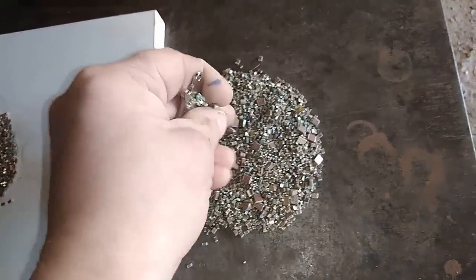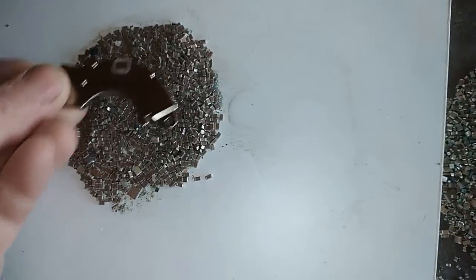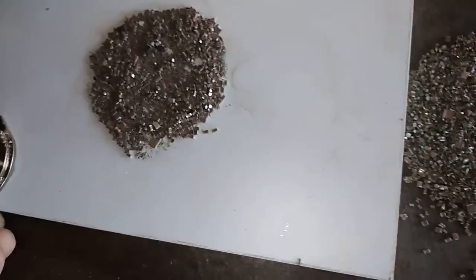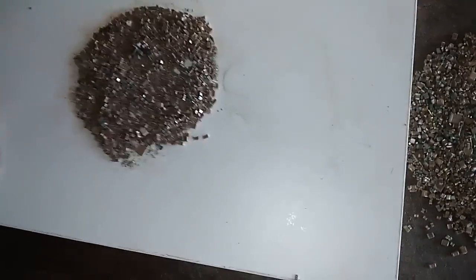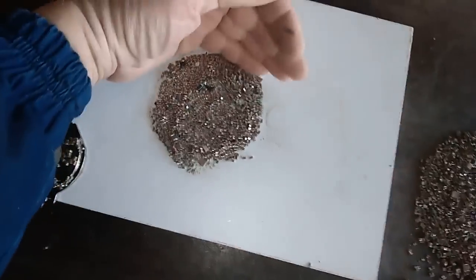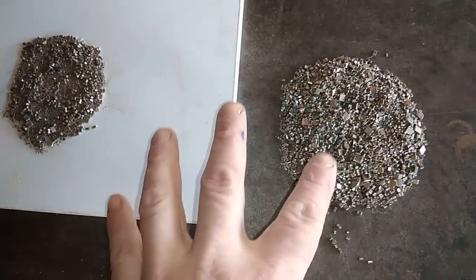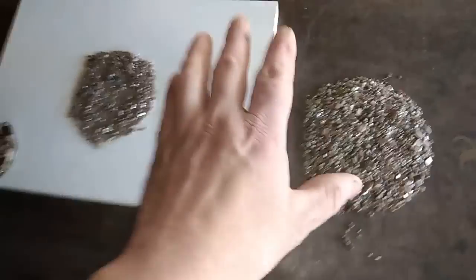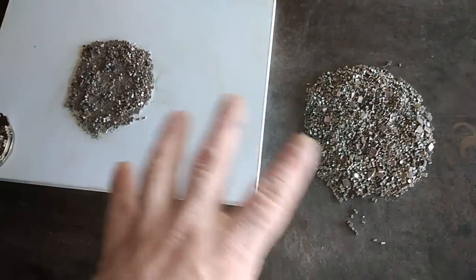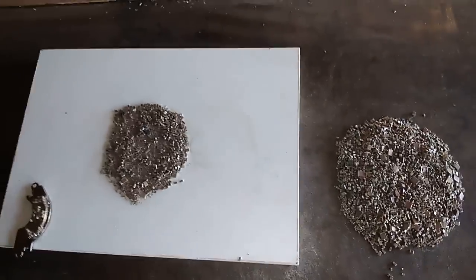Right now, this big pile here is magnetic, and this pile here is non-magnetic. I use a neodymium magnet because it's very strong - if something is truly non-magnetic, this confirms it. I will put them in two beakers: the non-magnetic in the small beaker, and the magnetic in the bigger beaker. I will add hydrochloric acid to both, because this stuff was removed from the board and I need to remove tin leftovers - we don't want tin in our solution.